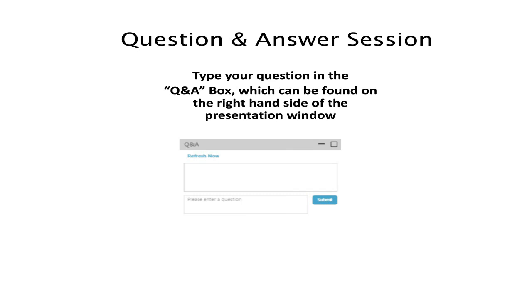The next question is, what other applications exist for the food market? I just recently produced an application note for analysis of debris in food ingredients, and we had an account come to us not too long ago with some filters which were used above their ingredient handling system.